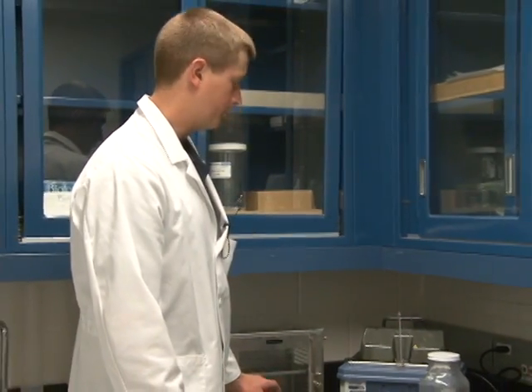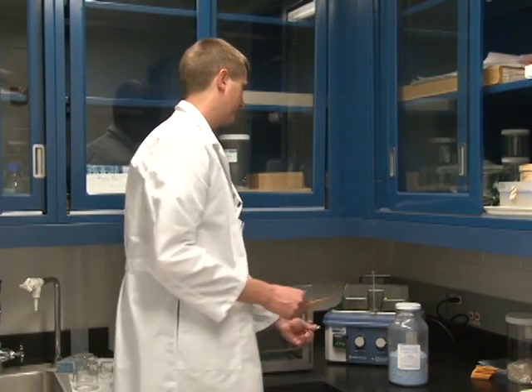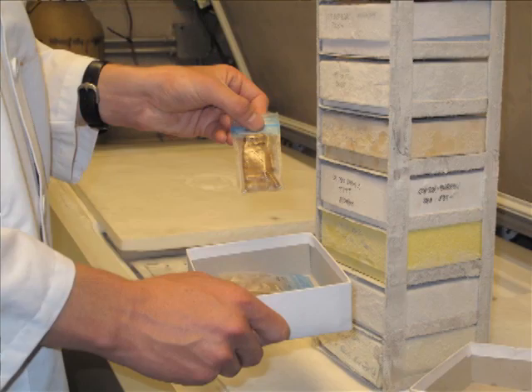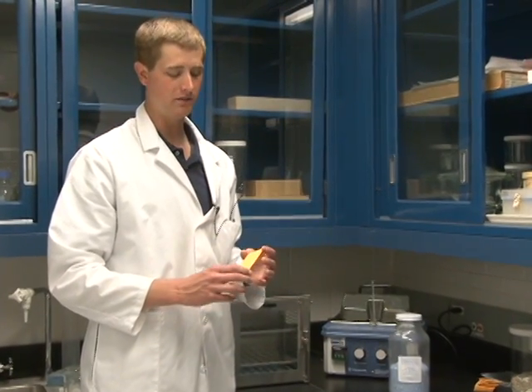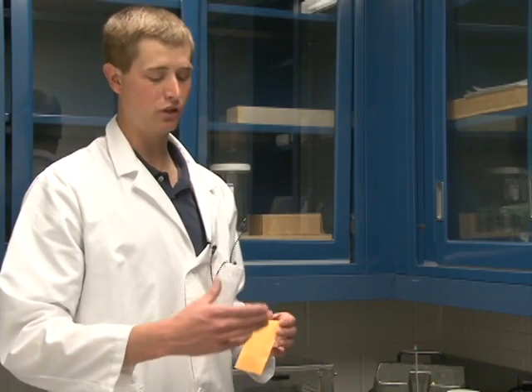After you have placed your spores in the desiccator for three to five days, you can take them out and place them into a very cold environment. At the Cereal Disease Laboratory, we place capsules inside envelopes into cold storage freezers — specifically a minus 80 degrees Celsius freezer. Another option is to place the spores into glass tubes and immerse those tubes in liquid nitrogen. Either way, we're keeping the spores very cold and very dry, allowing them to remain viable for years or even decades.